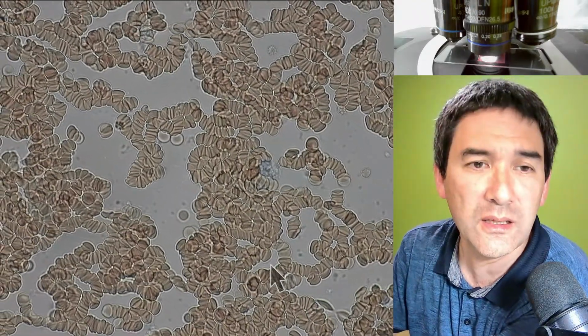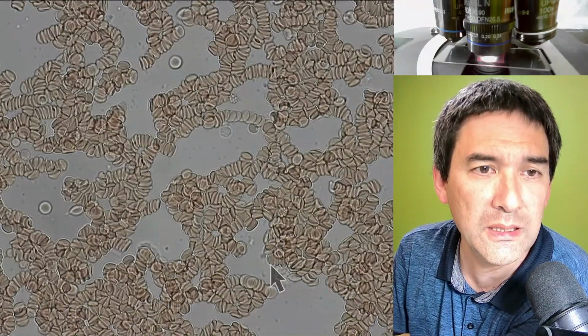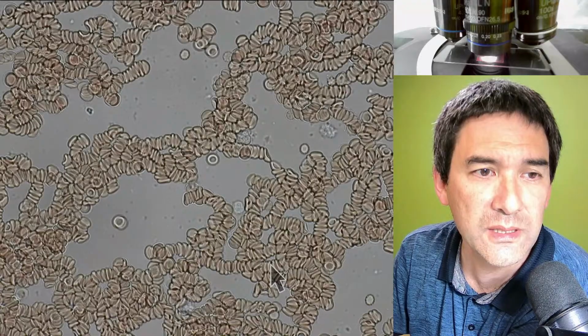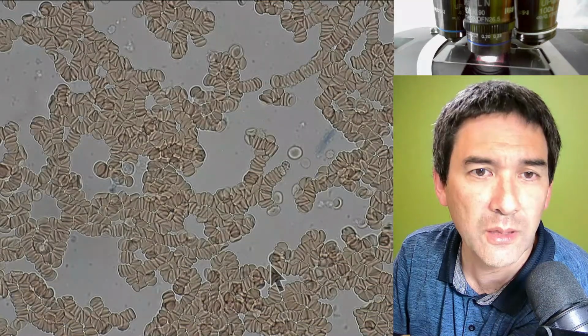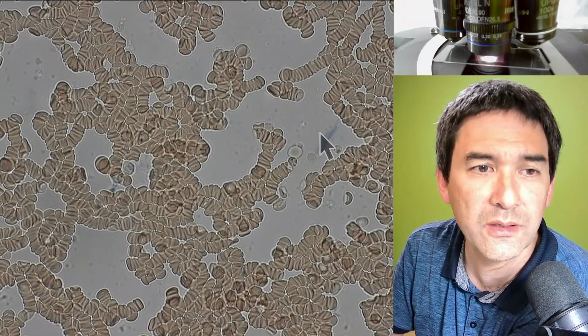At least I think we can agree that maybe this fountain pen ink might not be the best stain, at least in the way that I've done it right now, for blood. I mean, it does stain a few things blue.